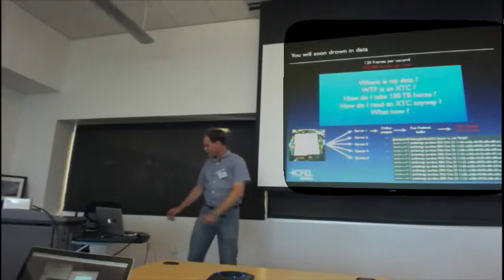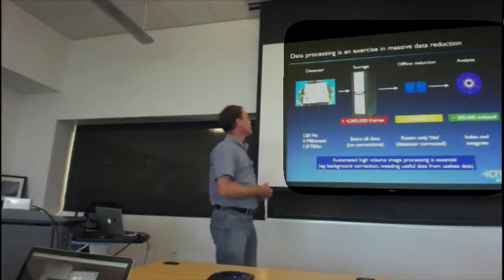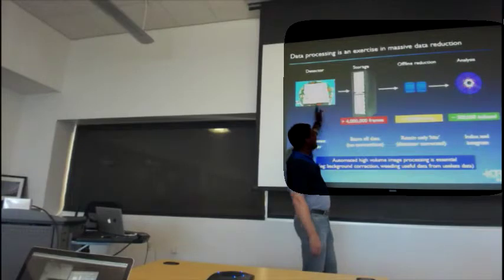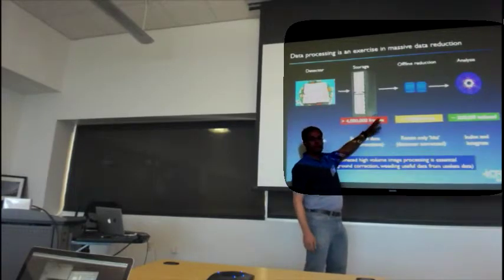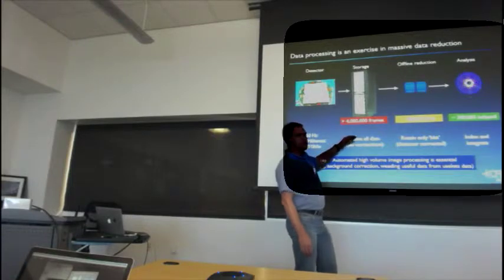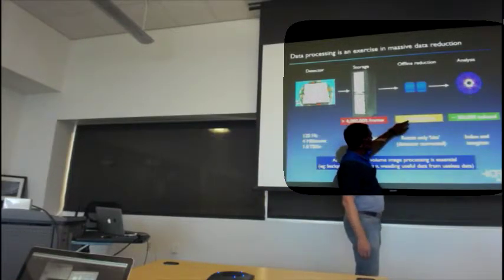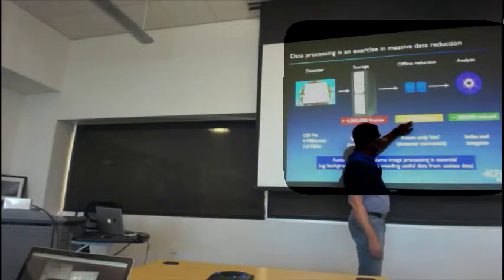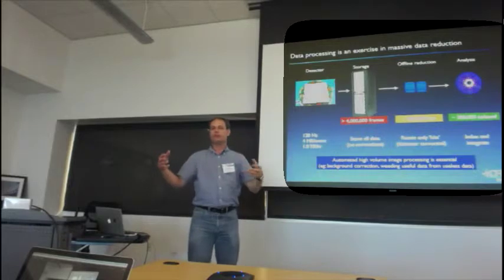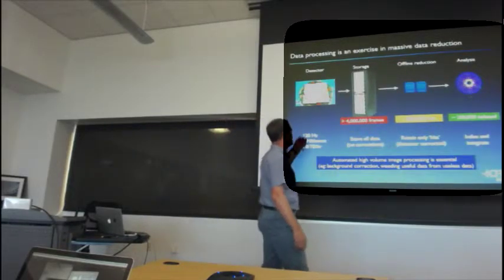you come home? So our approach to this has been to do basically massive data reduction up front. We got your detector, it goes onto storage, LCLS takes that, and for a given sample you might have something like 4 million frames there. Then what you do is you run a pre-processing step on it in which you identify only the frames that have hits in it, only the frames that have crystal diffraction. So now I'm just talking about serial crystallography.